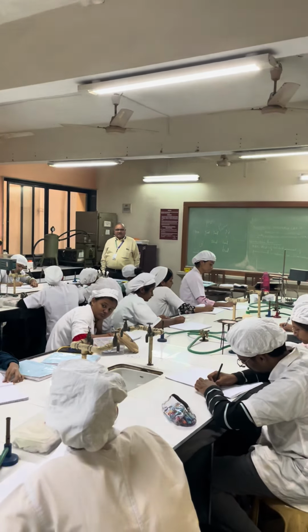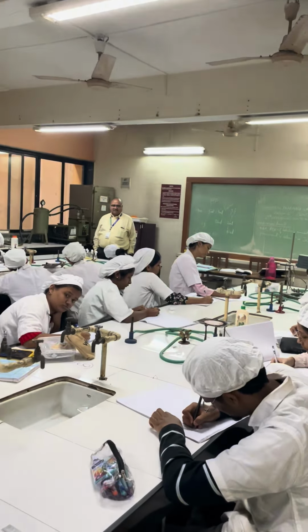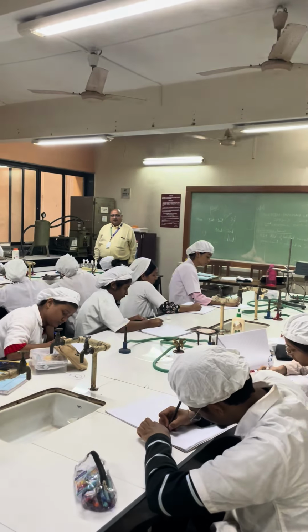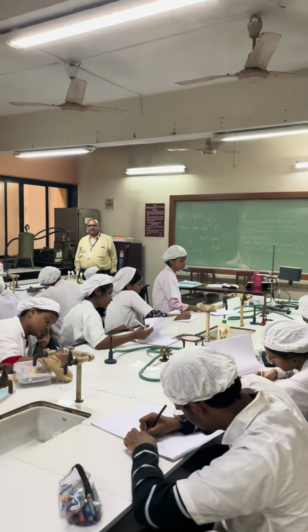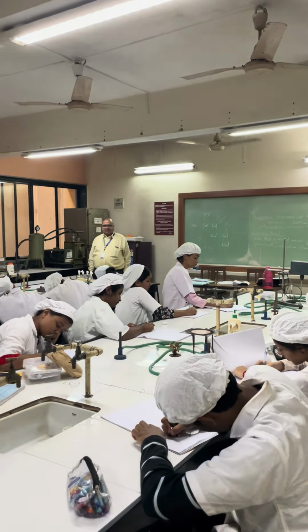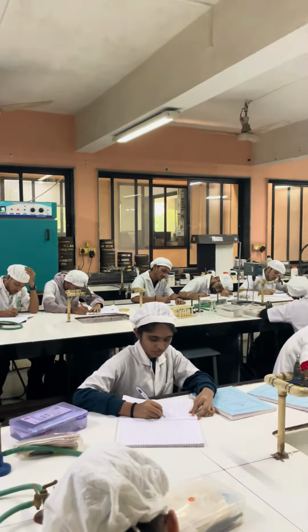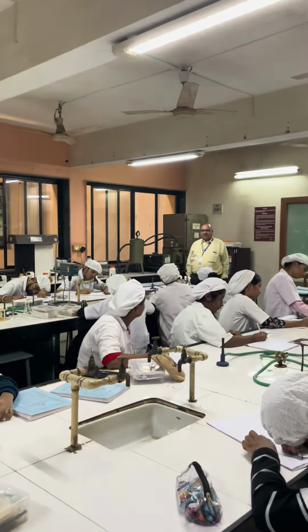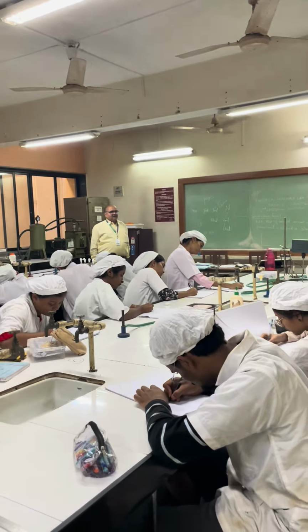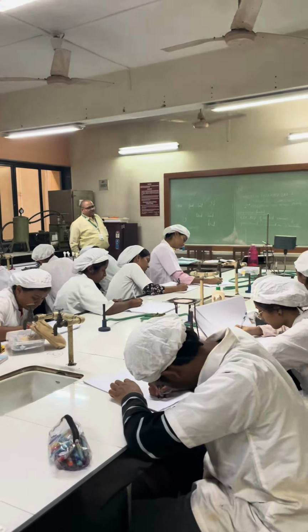Into all 3 single strength test tubes from the second row, add 1 ml of water sample. 0.1 ml of water sample is added to the third row, which contains sterile single strength lactose fermentation broth medium.